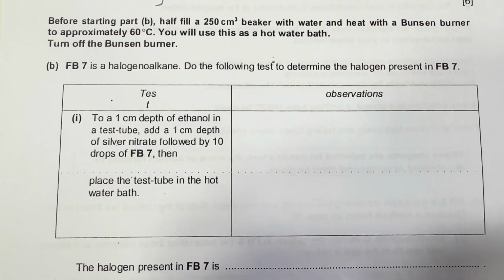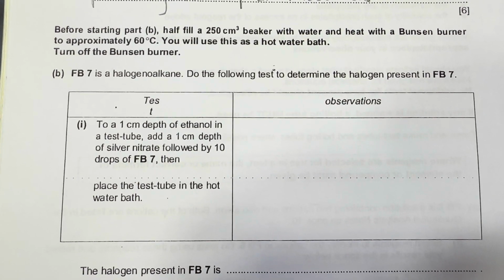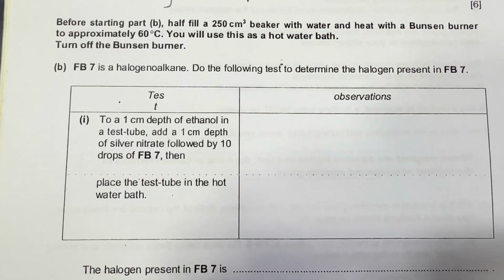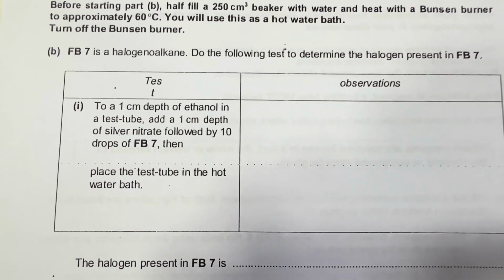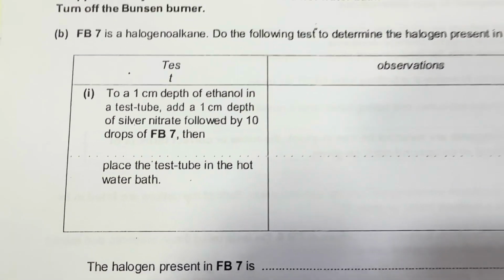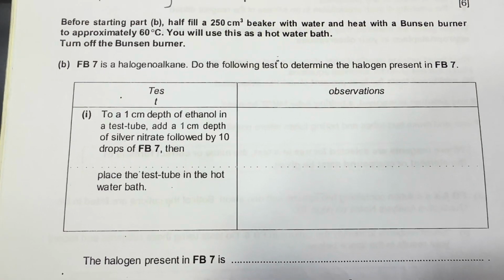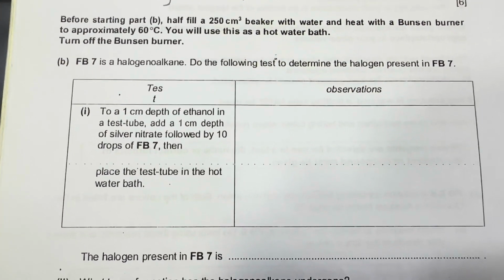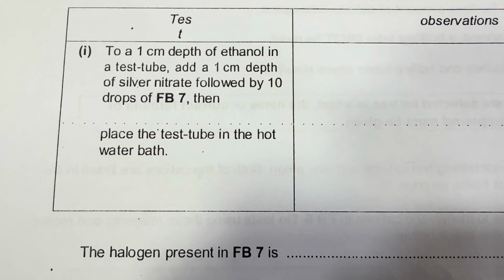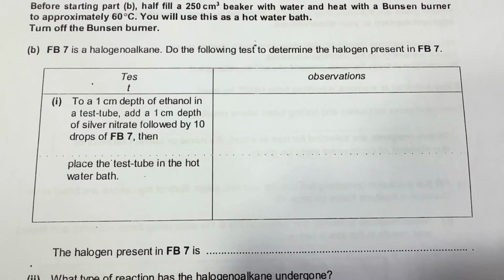To a 1 centimeter depth of ethanol in a test tube, add 1 centimeter depth of silver nitrate followed by 10 drops of FB7. After they have drawn a dotted line. Dotted line means you have to continue the test in the same test tube. Place the test tube in a hot water bath. So we will make all this mixture here and then we will put this in a hot water bath. And we will record both the observations in these two spaces. So let's perform this test.